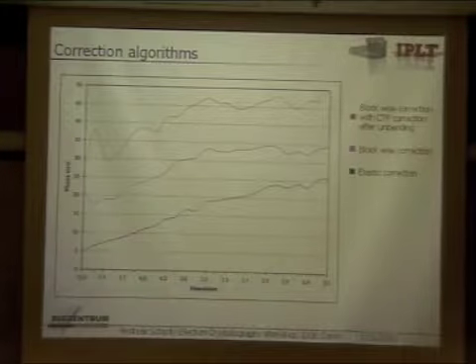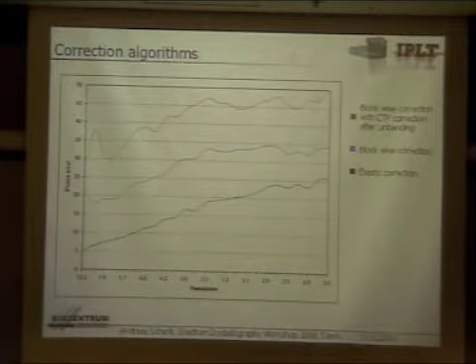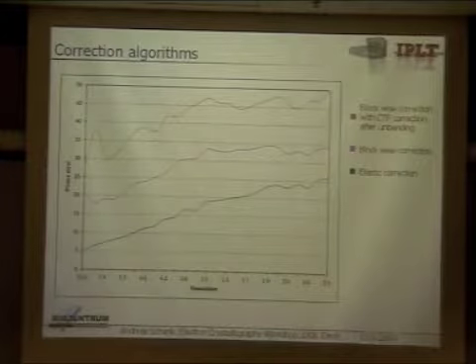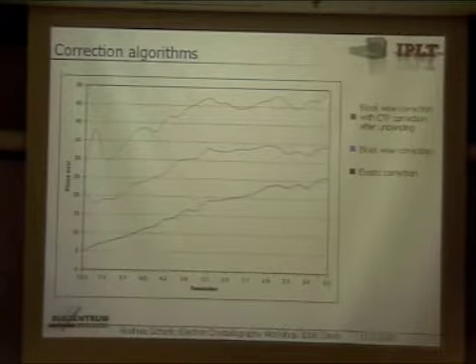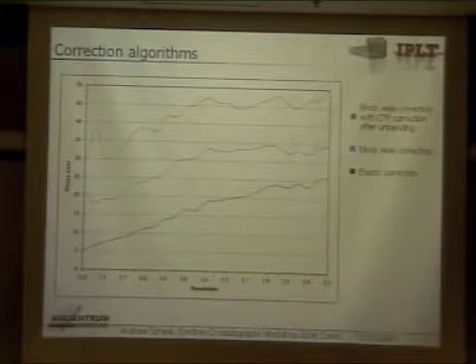Just here you would have the problem that you have to do the CTF correction on the current film image. Yes, so it will be slower because you have to correct the full image. And then on a tilted sample, yeah, that is reality. That's somewhere in the summary slide. That's now for untilted samples. It's easier. As soon as you tilt, it gets even more complicated.